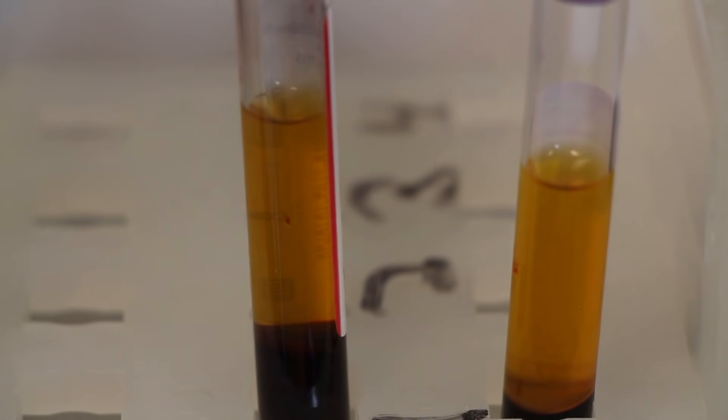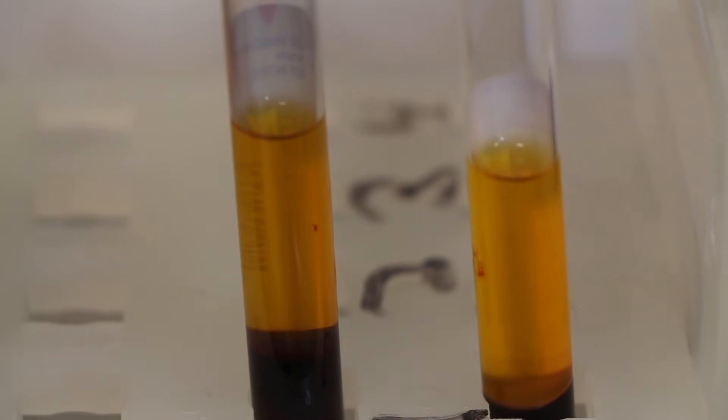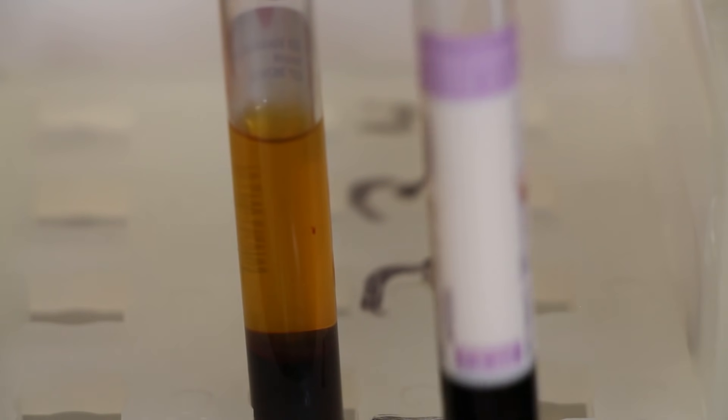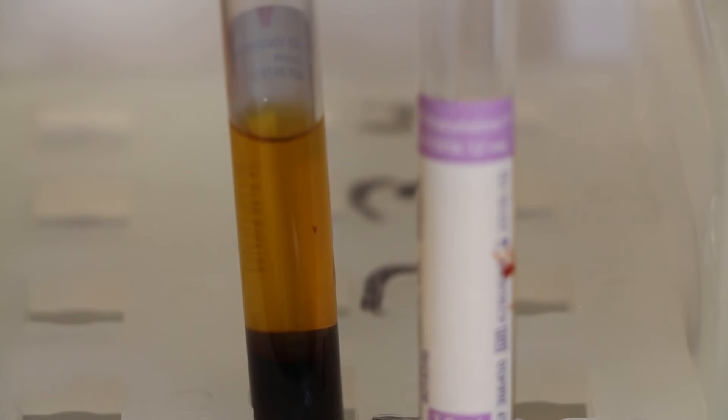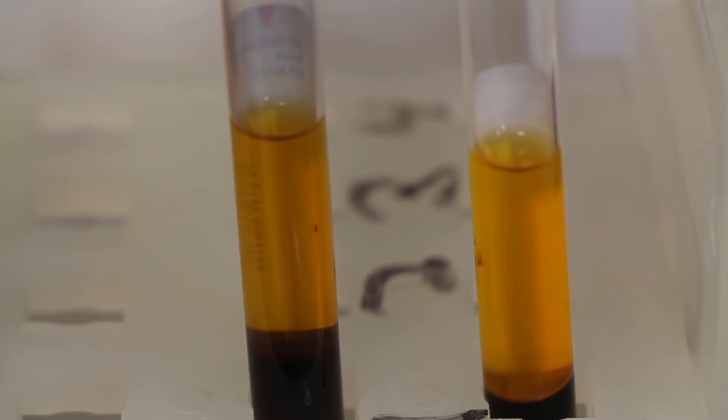The anticoagulant tubes are going to have plasma in them, so that liquid is going to still contain platelets. The coagulating tubes are going to have serum in them because all the platelets have coagulated and been spun to the closer to the cells in the bottom, the red blood cells at the bottom.